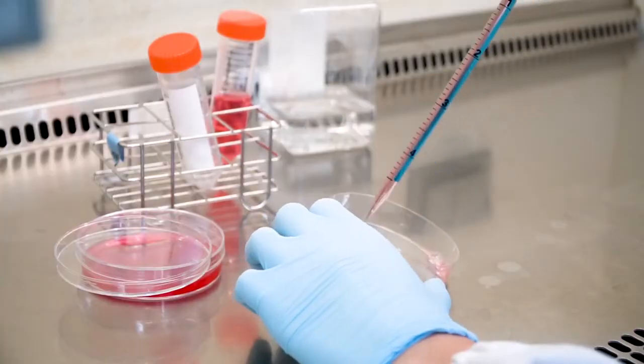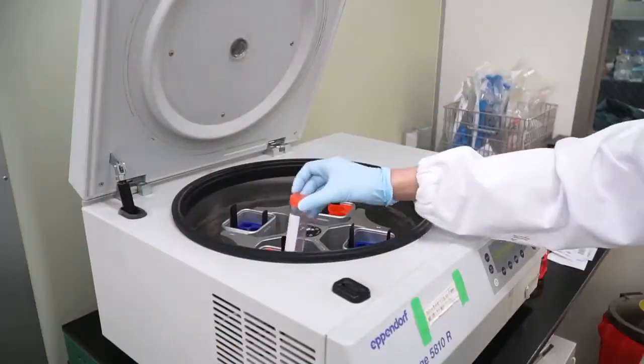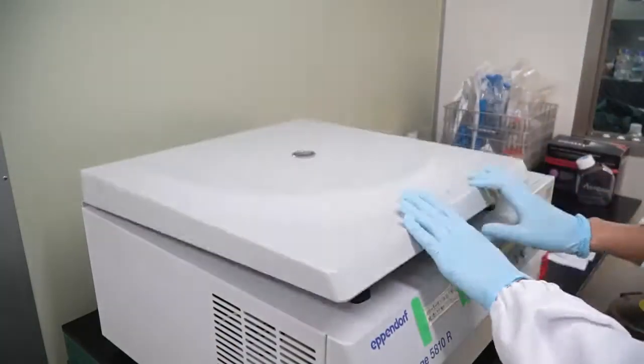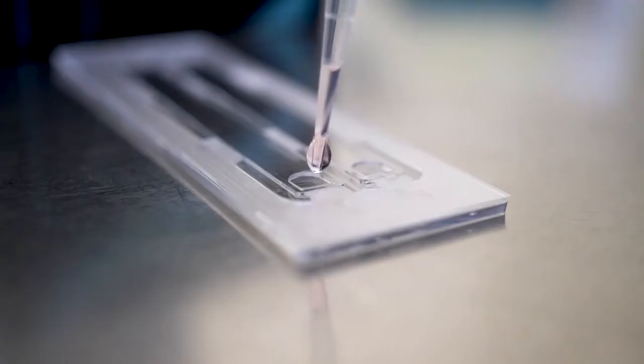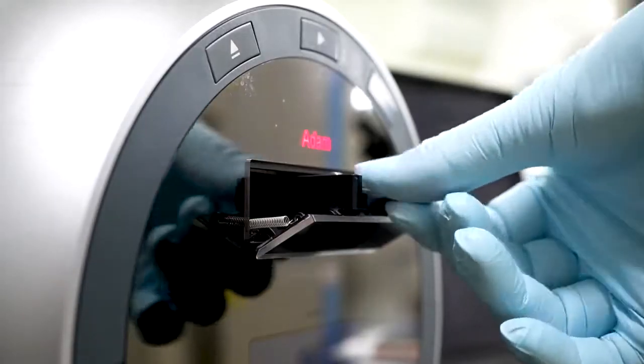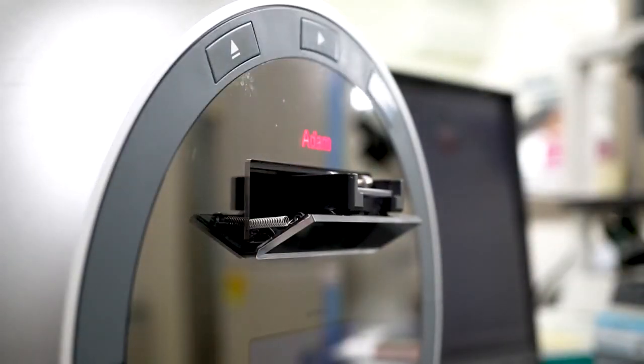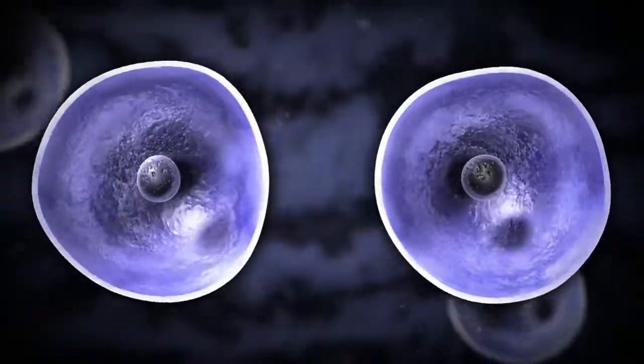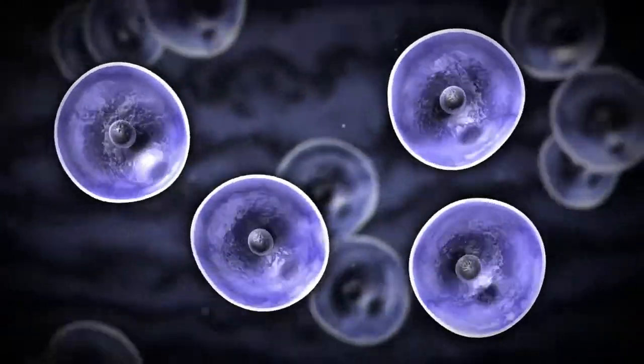The R&D team has discovered key technology in destroying the 3D cell structure, paving the way to successfully harvest cells from 3D frameworks, boosting the recovery rate to over 70%.